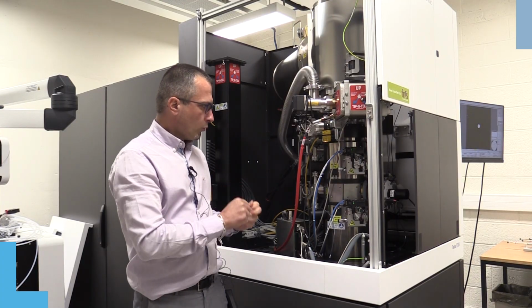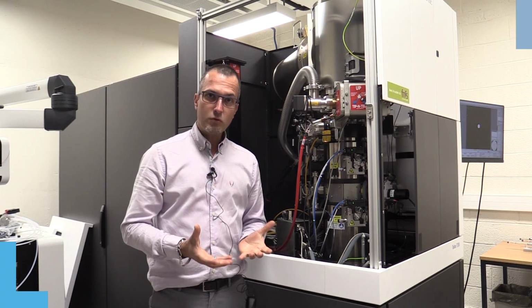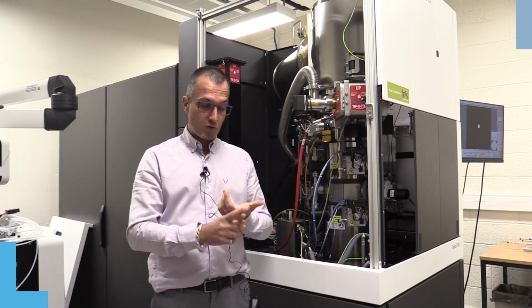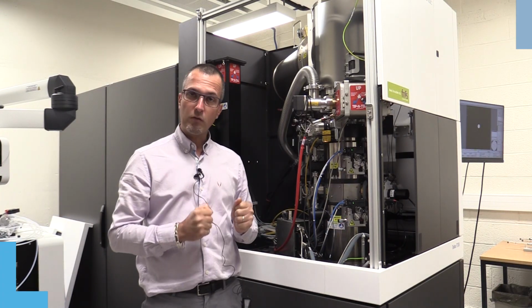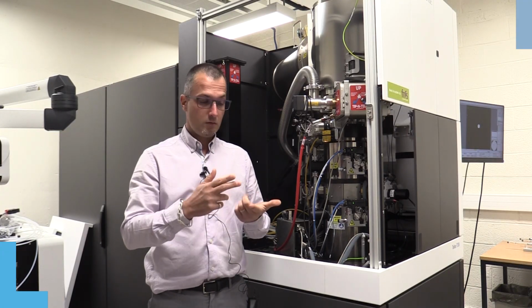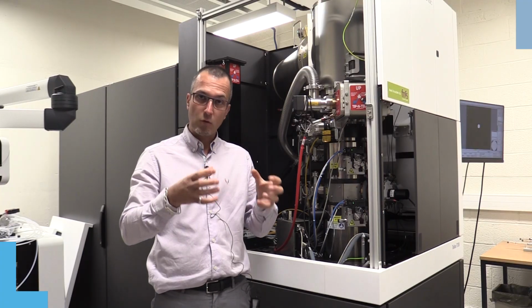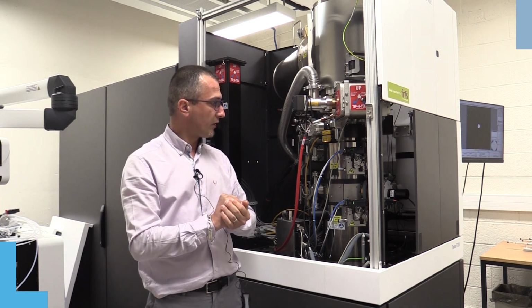With this microscope, we can look at different types of materials: metals, semiconductors, polymers, a wide range of materials. And from the information we're going to collect, we can learn about crystallography, size and morphology, or composition, or even how the atoms are bound together and how they interact with the application.